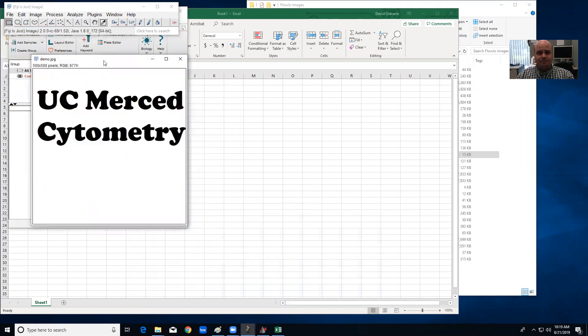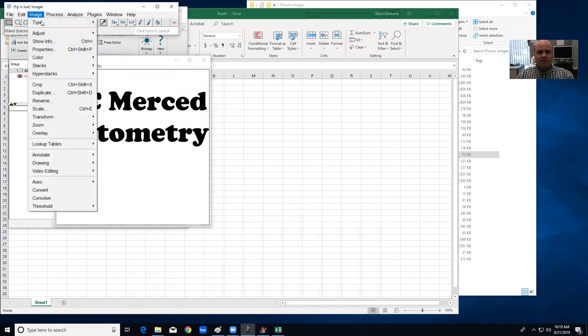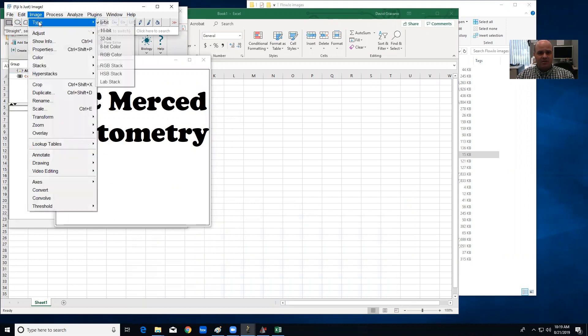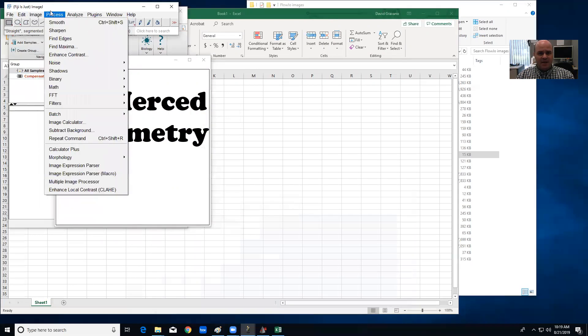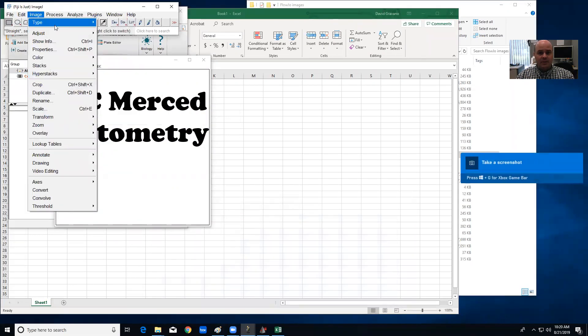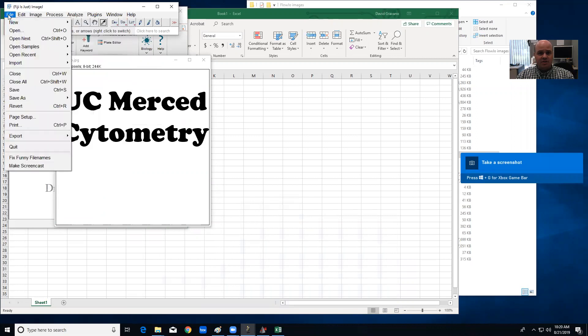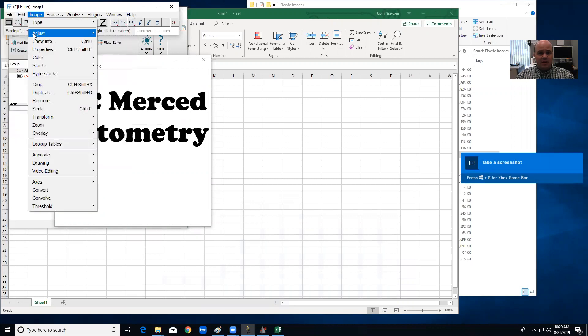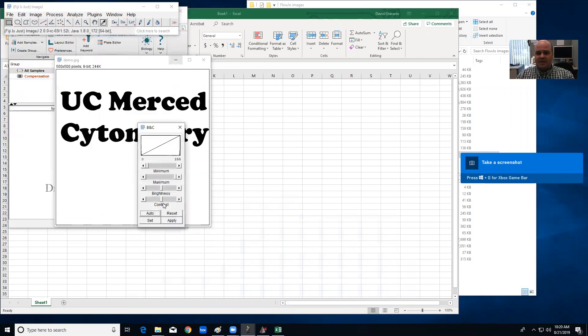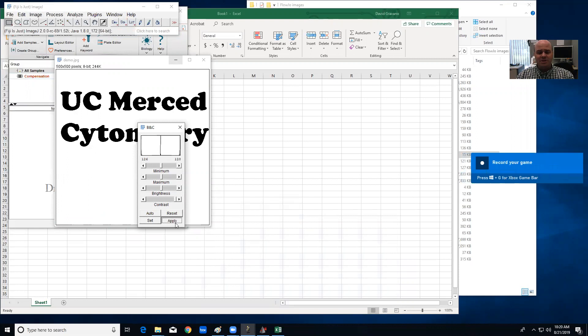First I'm going to convert it to just an 8-bit file by going Image, Type, 8-bit. Next I'm going to process that image or adjust the brightness and contrast. So I'm going to make it as contrasty as possible just by upping the contrast all the way. That's just to make sure all the pixels are either all black or all white.